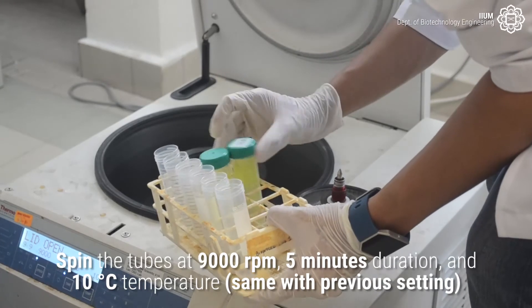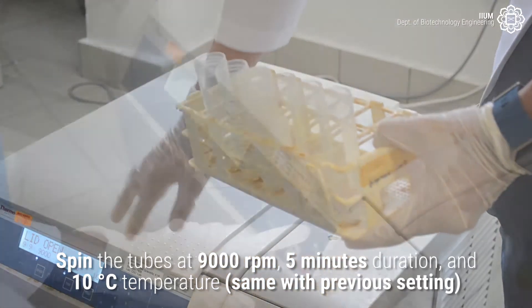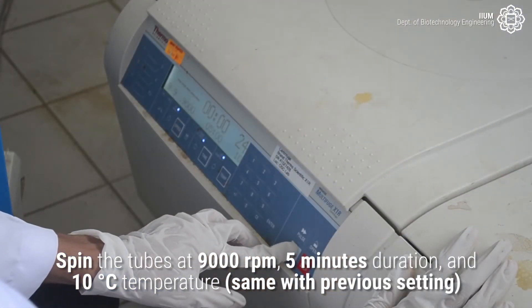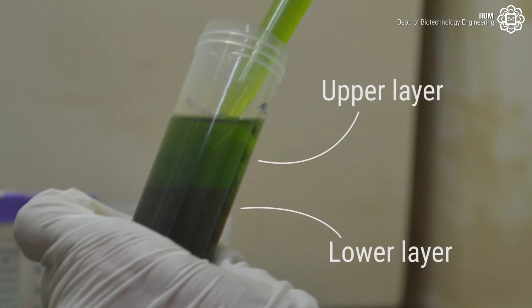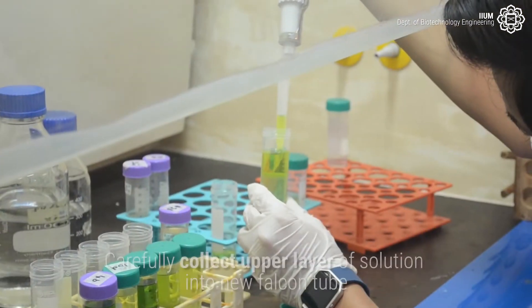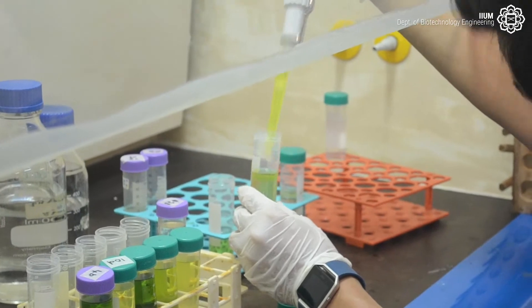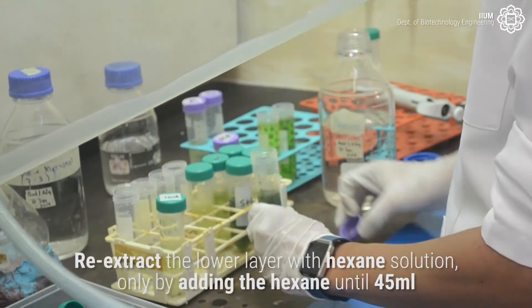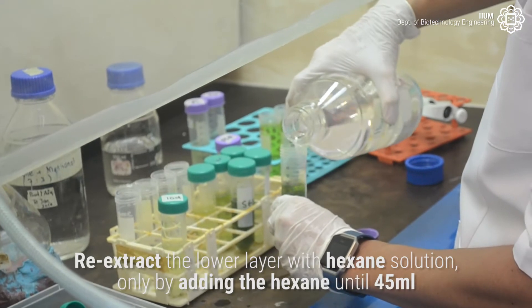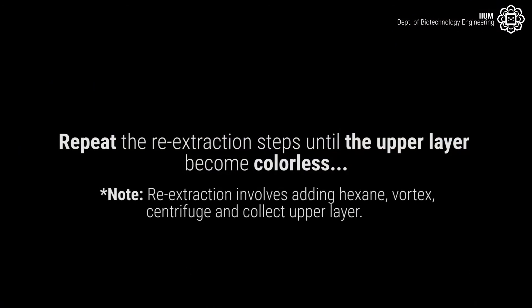Spin the tubes at 9000 revolutions per minute, 5 minutes duration, and 10 degrees Celsius temperature. After centrifugation, the mixture will be separated into two layers. Carefully collect the upper layer of solution into a new falcon tube. Re-extract the lower layer with hexane solution by adding hexane until 45 ml. Repeat the re-extraction steps until the upper layer becomes colorless.